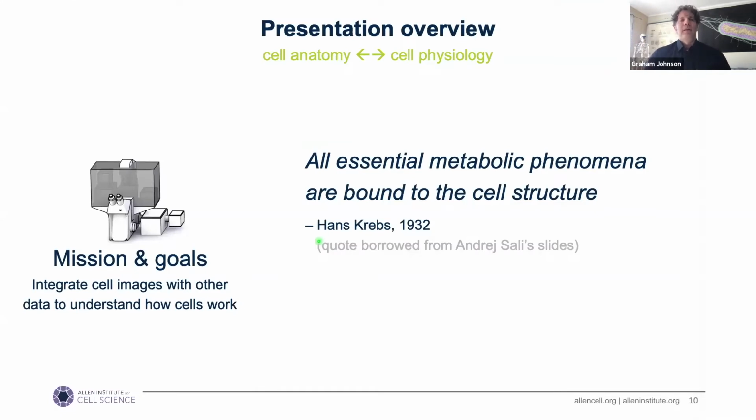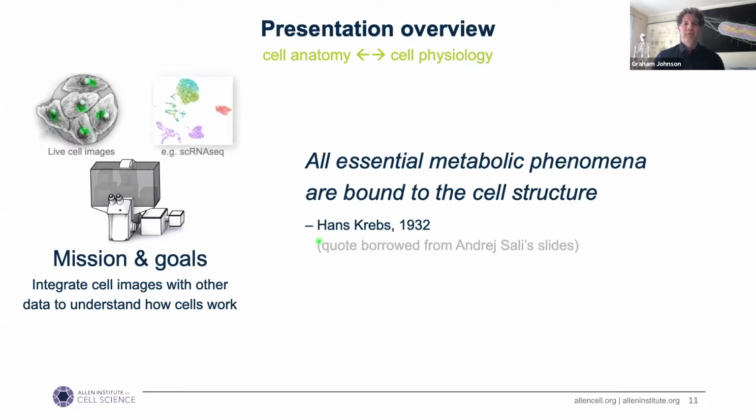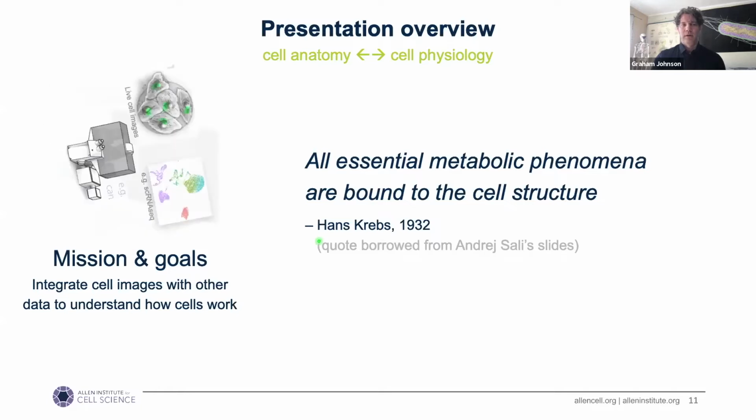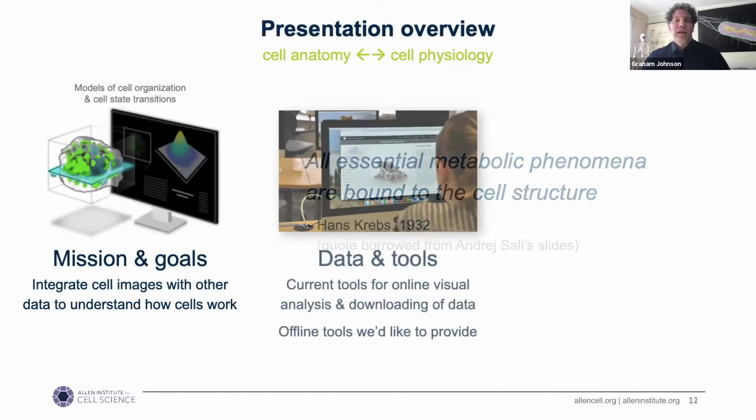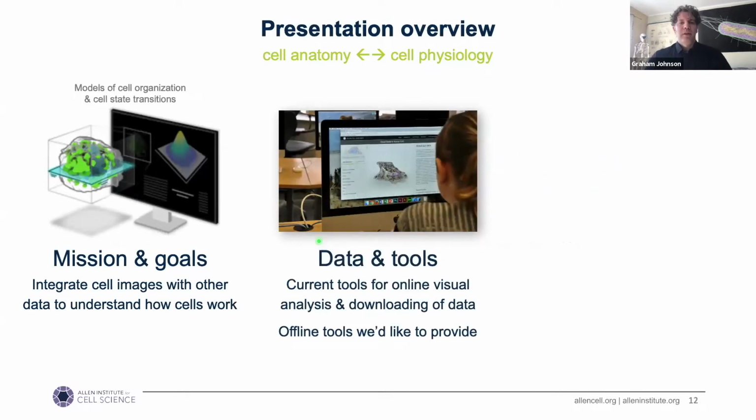Let's get started. So I want to overview a major goal of the Institute, which boils down to integrating the structural anatomy of cells that we can see in our microscopes with other data to be able to infer and learn the physiology of cells. I want to quickly highlight some of the tools that we currently provide online, while also describing some of the more sophisticated tools we hope to make available in the future.